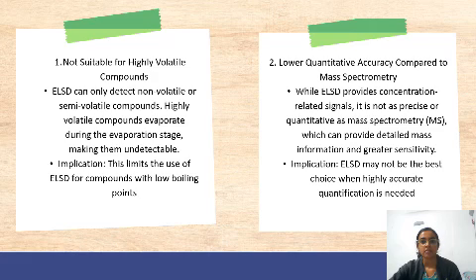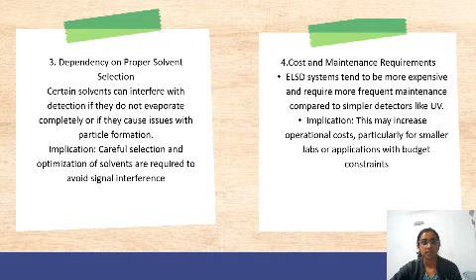The third is the dependency on proper solvent selection. Certain solvents can interfere with detection if they do not evaporate completely, or they can cause issues with particle formation. Its implication is that careful selection and optimization of solvent are required to avoid signal interference.